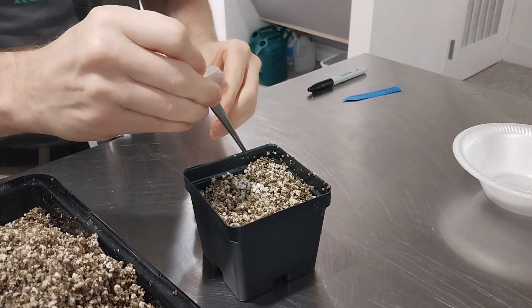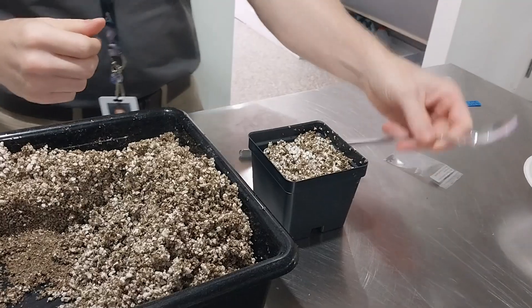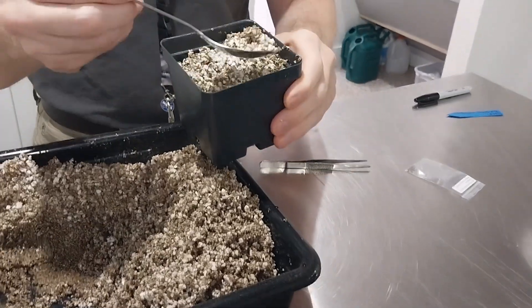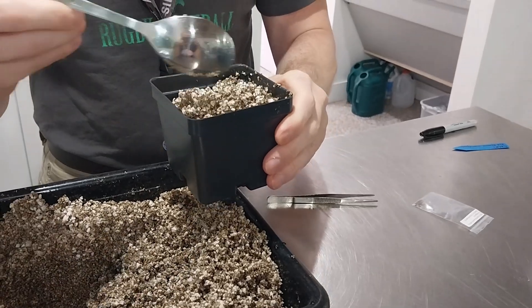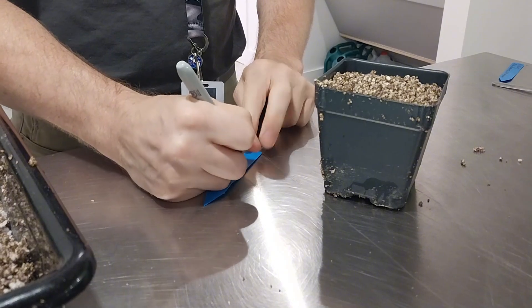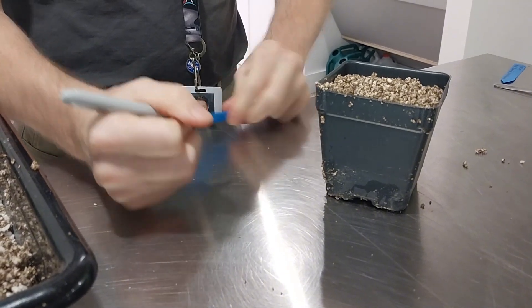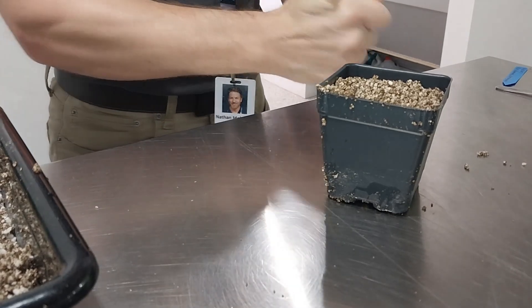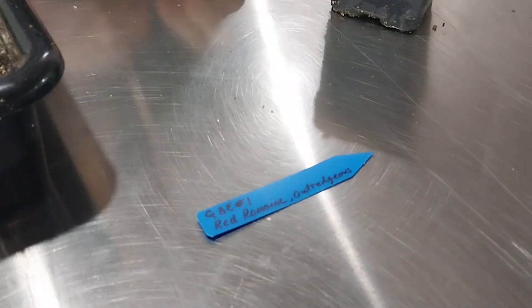Using tweezers, place eight seeds in the pot, then lightly cover the top of the pot with the same mixed media. Next, you will label each pot with the plant tag. One side will say the GBE number and the plant name, and the other side will have the date that the seeds were planted.